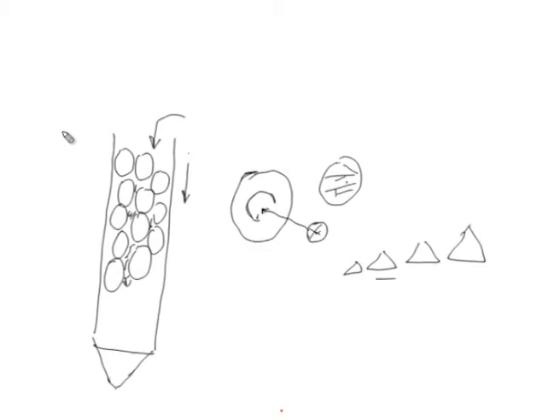Now, these columns, like I said, are long and narrow bore. So, they could be for low pressure, where there could be coarse beads or bigger beads, and for high performance liquid chromatography, there could be finer beads which are packed very nicely.